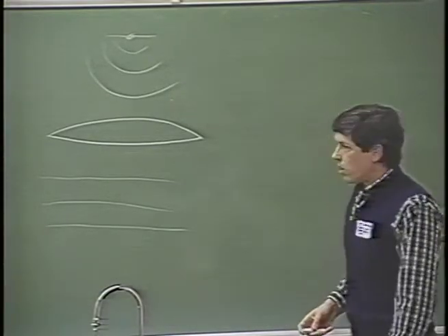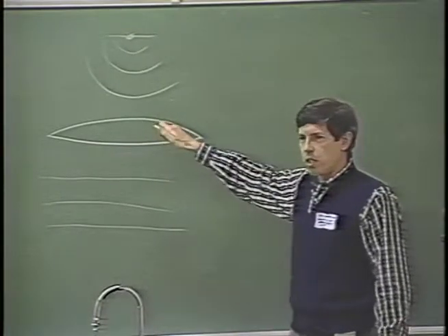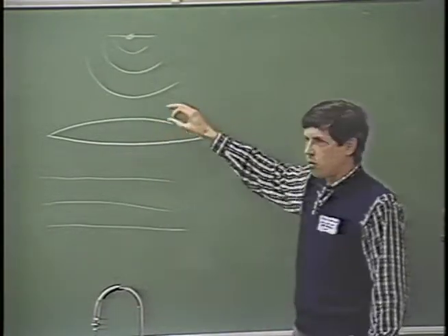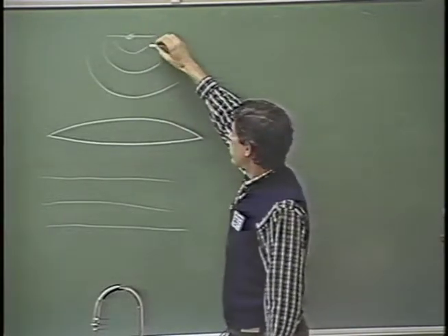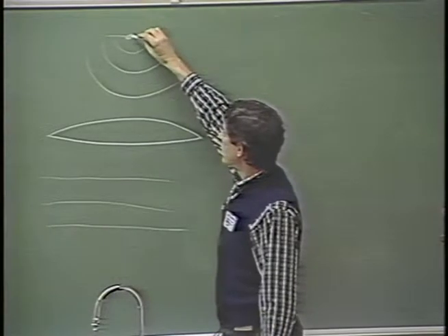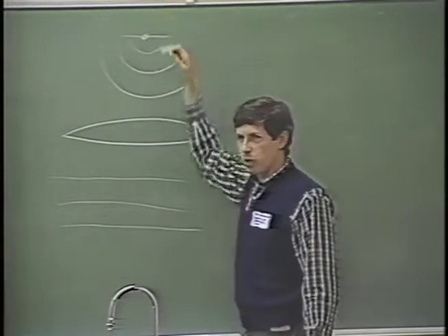Now, the defocus that you introduce by changing the strength of the objective lens, you can also, at least in principle, refer to by conceptually moving the specimen from this point to some other point.